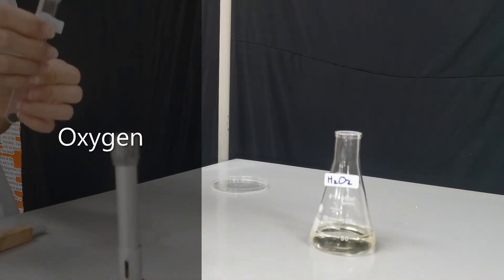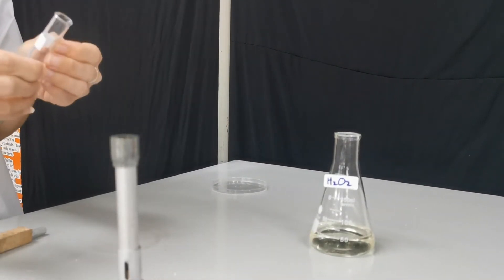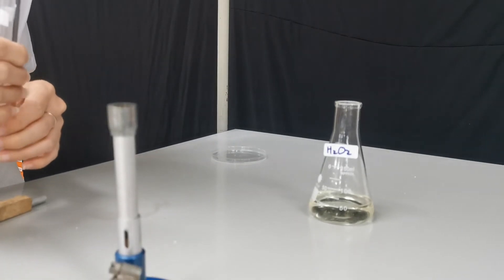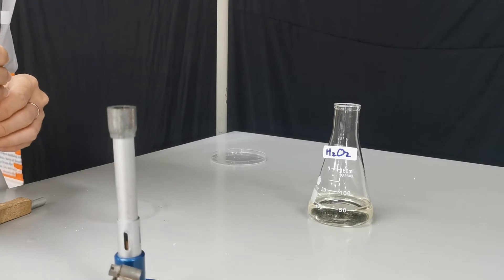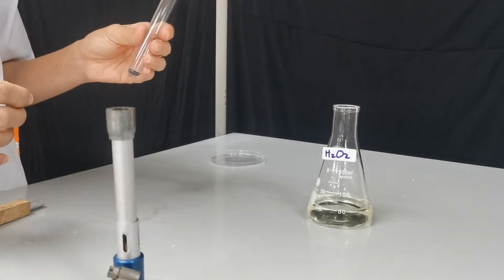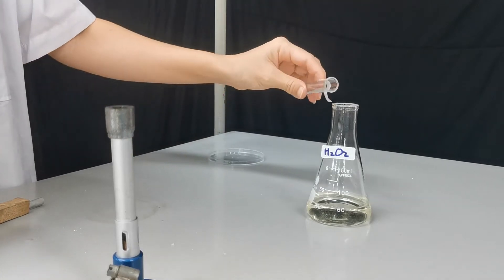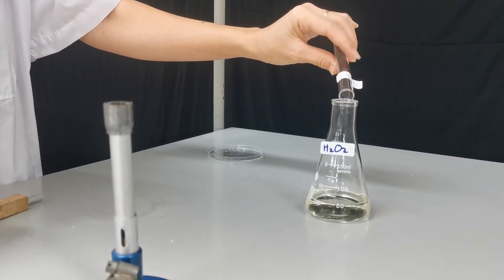The next test is for oxygen gas, and we can create oxygen by decomposing hydrogen peroxide. Hydrogen peroxide decomposes at room temperature and pressure without any special conditions, but it does so very slowly. To make it decompose faster, we add the catalyst manganese dioxide (MnO₂), and we just need a little bit of this.